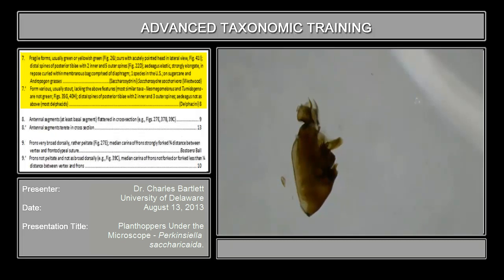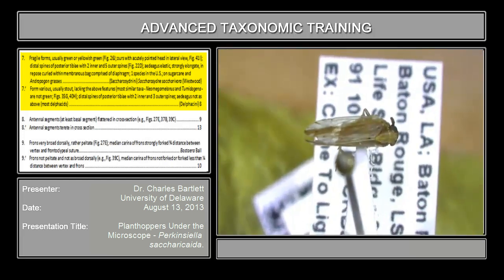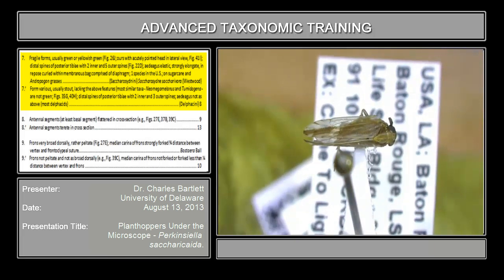So couplet 7 is separating the tribe Saccharosydnini from the tribe Delphacini. If we had Tropidocephalines in North America, I'd have to separate them here too, but we do not. Couplet 7 reads: fragile forms, usually green or yellowish green. Here is the specimen you should be looking at. Is this green? No. Is this fragile? No. When you see a Saccharosydnine, you will know it for being both green and fragile.